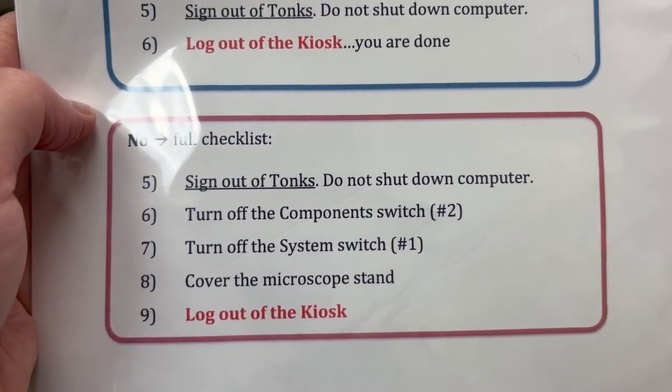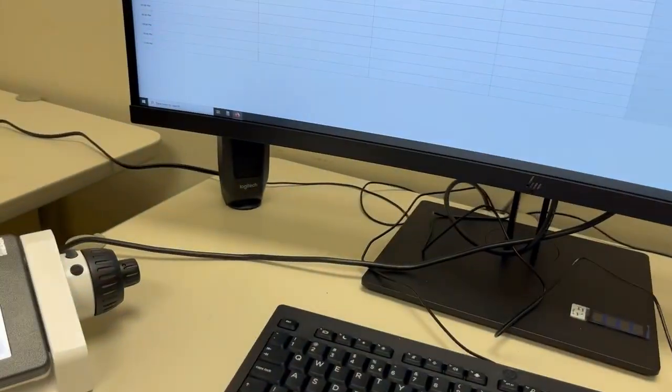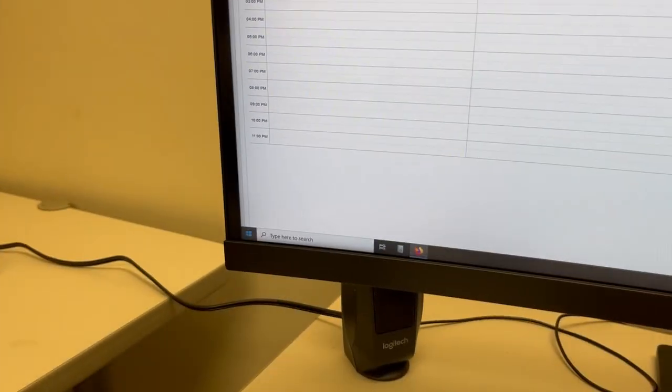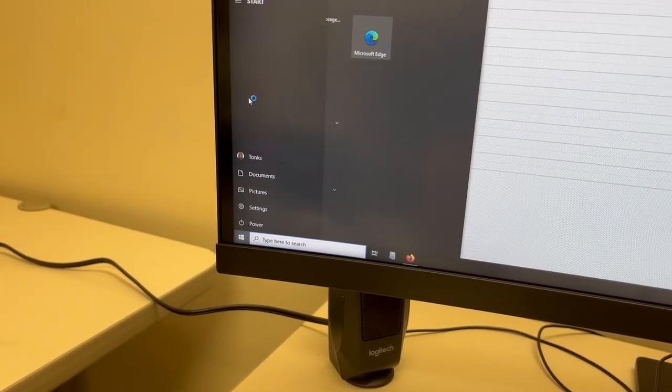The first step of the full checklist is the same as in the other case: sign out of Tonks, but do not shut down the computer. We can sign out of Tonks by clicking here, clicking on Tonks' face, and then saying sign out. You can see the computer signing out.